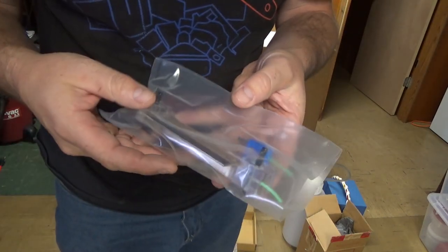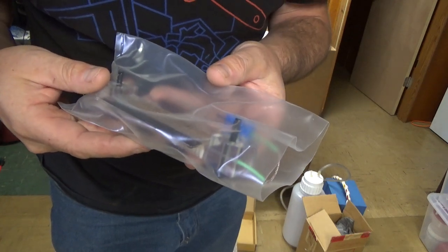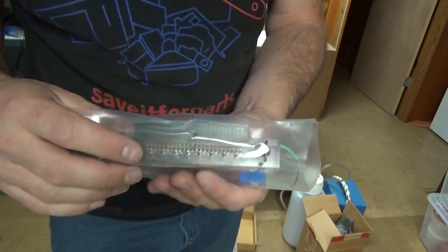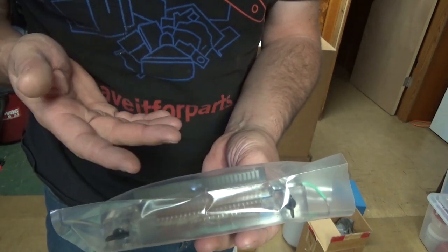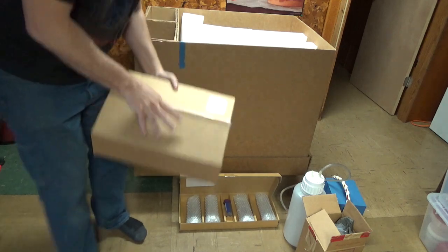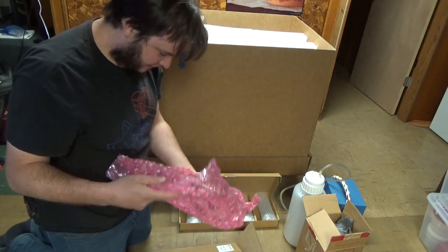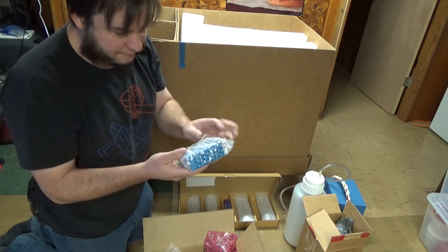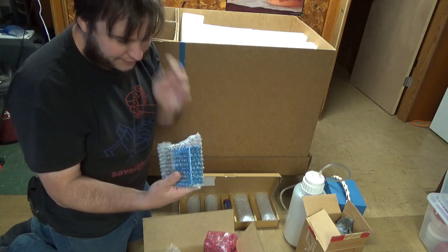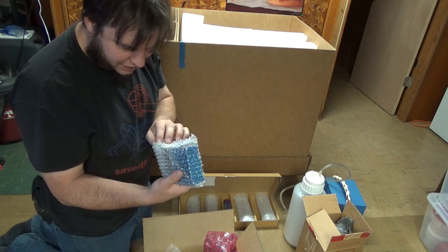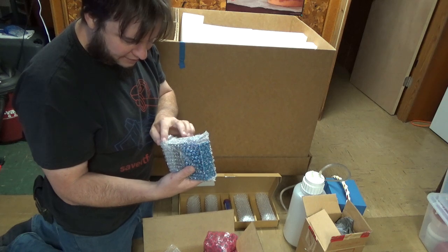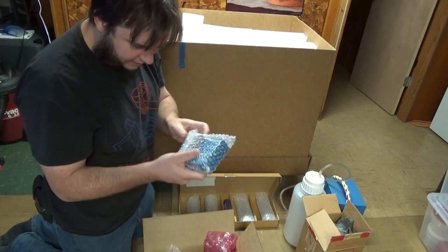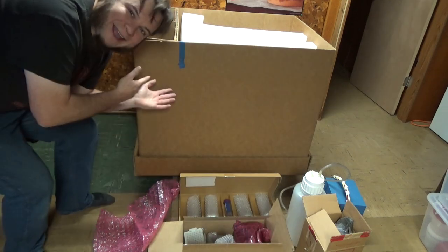We've got a little test tube here and whatever these are. Alright, these seem to be some kind of a plug-in module for our sequencer here. I don't quite know what this is. Yeah, we're going to set this aside. Don't know what it is yet. Don't really want to open it up yet because I don't want to damage it. Alright, we've got another little box. There's lots of stuff in this one. Got another Nalgene bottle. Got some very heavy little metal plates. This one says GLS conditioning and this one's an elution buffer. A big dye mix, some beads and oil. And some more things that look like test tube or sample holders.